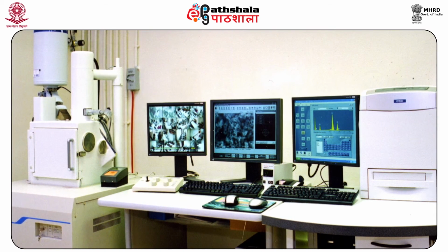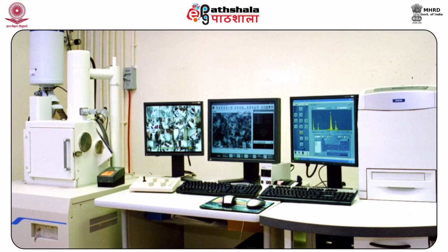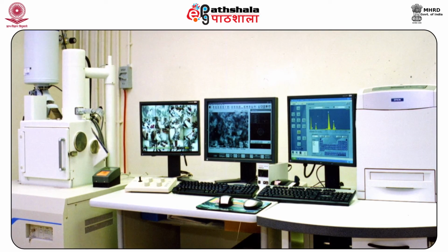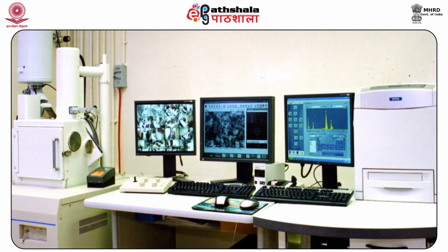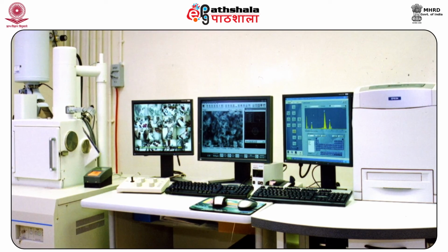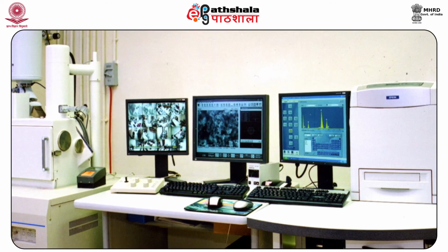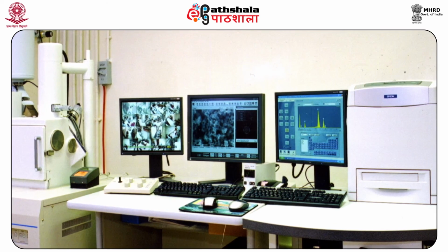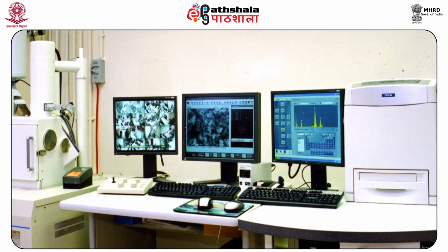that one of the biggest advantages to the forensic scientist is that gunshot residue particle analysis is a non destructive method in nature, and the sample can be preserved for court evidence as well. Whereas most of the techniques used for this type of analysis are destructive in nature. So, we have a benefit in this case.